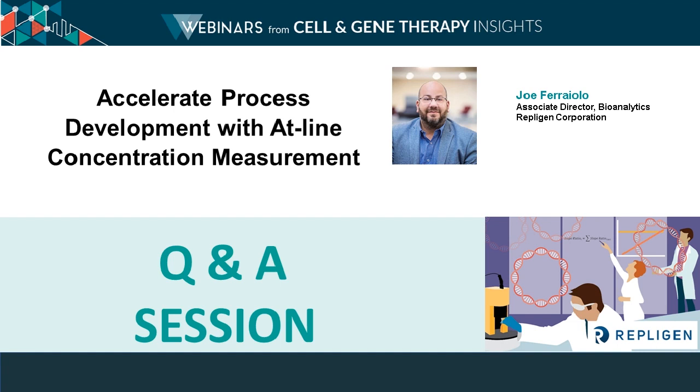Thank you. And can the SoloVPE method be used for release of GMP finished drug product as well? Yes. So that's where the majority of our business is in GMP environments related to drug substance or drug product.